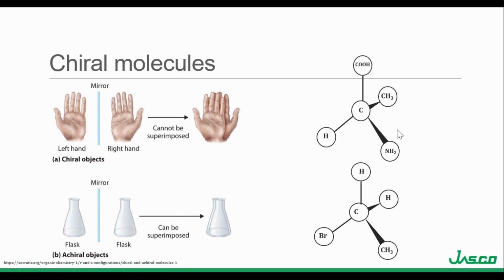In a chiral molecule, all the substituents bound to that carbon center are going to be different, which is really convenient for secondary structure analysis because the peptide backbone chain, or the amino acid residues of the peptide backbone chain, are chiral. In an achiral molecule, one where you would not see a CD signal, two or more of the substituents bound to the carbon center are the same.